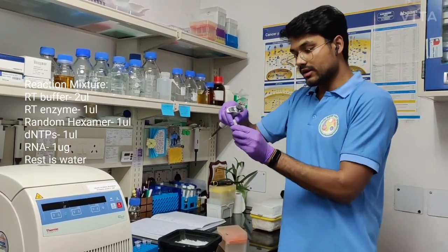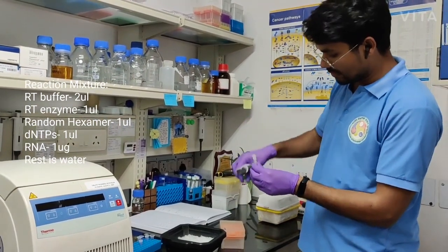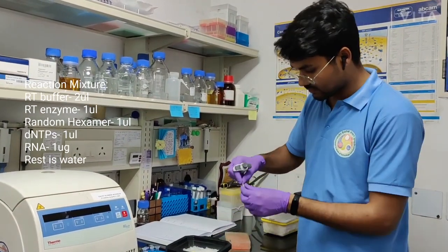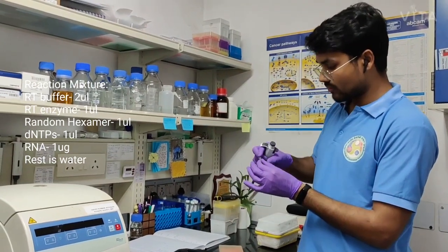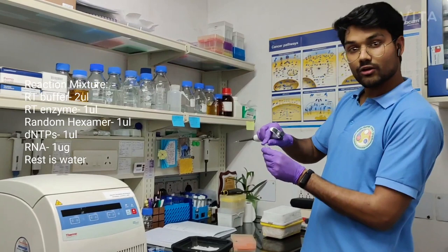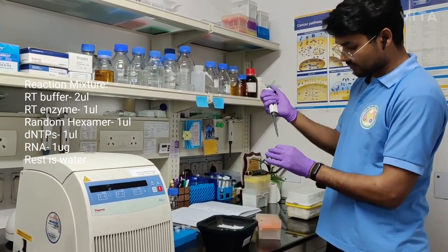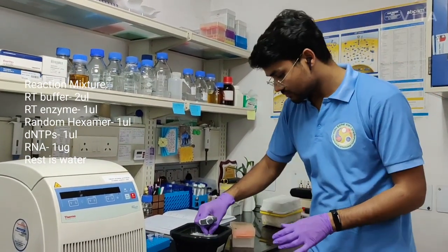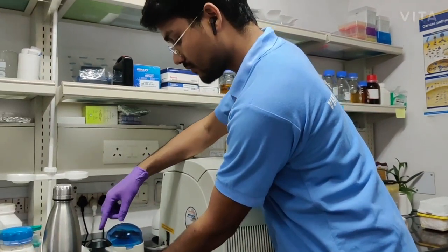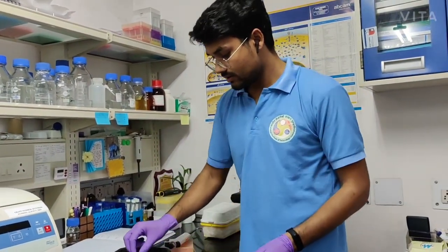I have the 10x RT reverse transcriptase buffer. So for the 20 microliter reaction, I will be adding 2 microliter. Now 5 microliter is water. Now we just short spin the tips. Next step is to add the RNA that we have isolated.